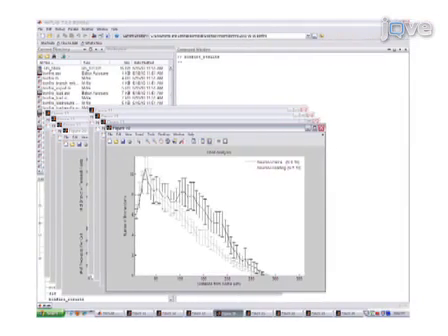Finally, the Bonfire MATLAB program is run to extract morphological data from the cells, including shoal analysis, as well as the number of neurites, branch points, and neurite tips.